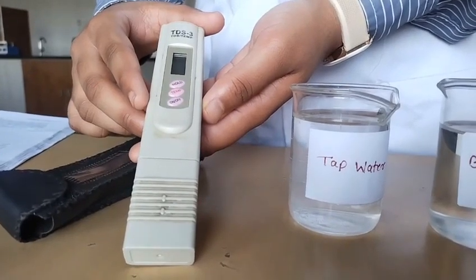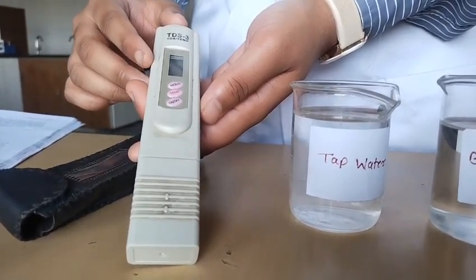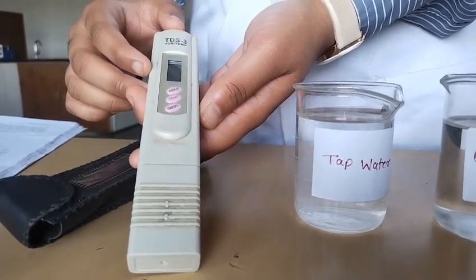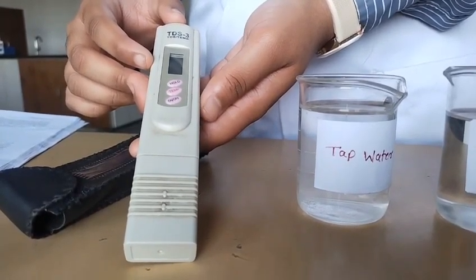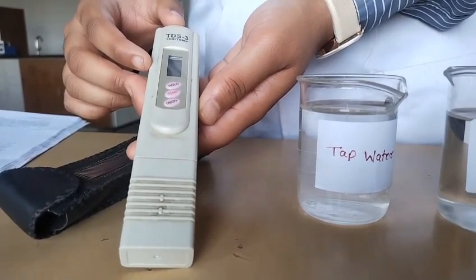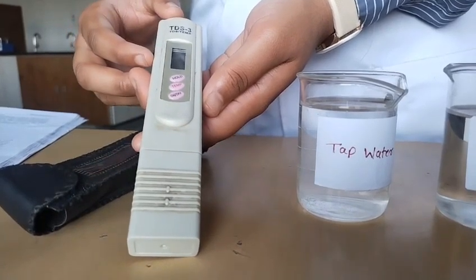Most of the TDS meters are calibrated at a particular temperature, that is 25 degrees Celsius, which is a common temperature. If the temperature of water is greater than 25 degrees Celsius, as right now the temperature is 28 degrees Celsius, the TDS reading will be higher than the original value and vice versa. Therefore, correction formulae are used to get the actual TDS reading.